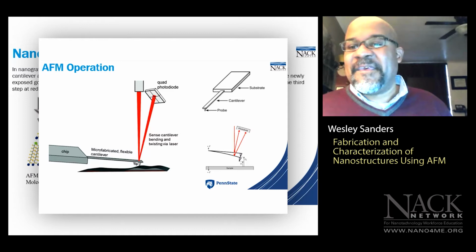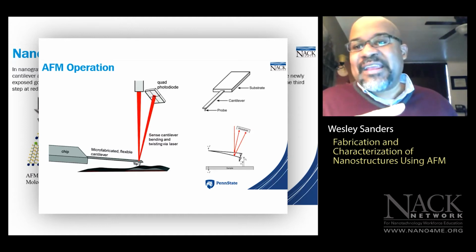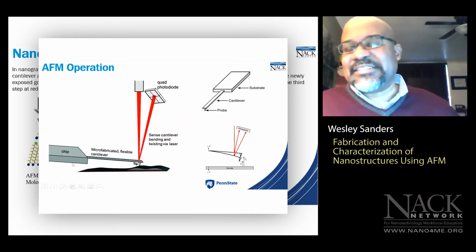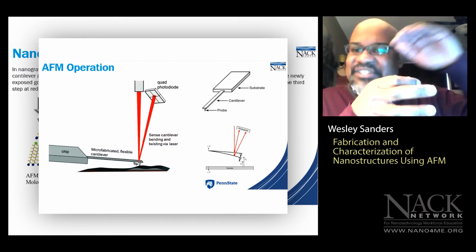Okay, and you have the stage so well controlled that you can move it in nanometers? Right, well, with the scanner, you can have two different types of AFM configurations. You can have what's called tip scanning or sample scanning. So all three of our AFM systems are tip scanning systems, which means we mount the tip on the probe, we mount that directly to the scanner, and the scanner moves the tip while the stage is stationary.